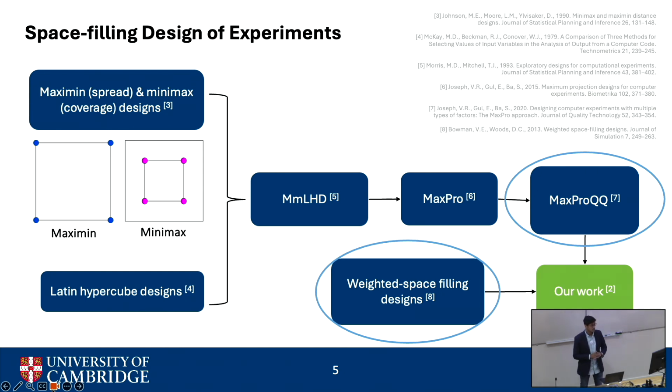Now, recently in the last decade, the group of Roshan Joseph at Georgia Tech came along with this new MaxPro method. A maximum projection design is a type of Latin hypercube design subject to the MaxPro criterion, which has better space-filling properties in all other subsets of factors. So where I'm looking at formulations with surfactants, polymers, thickeners, if I fix the thickener and want to see how the response of particular surfactants behaves with this thickener, and I'm not looking in the full p dimensions, but here p-1, I fix something, then actually the MaxPro design is better.